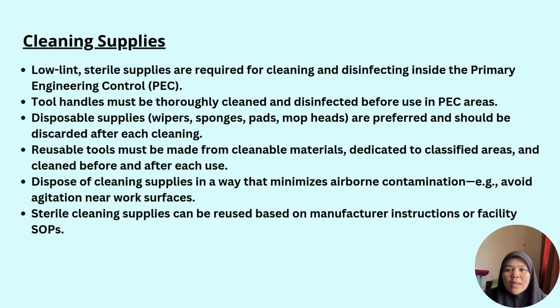Cleaning supplies used in the prefilled syringes production area must meet strict standards to preserve sterility integrity. All materials must be low-lint and sterile, especially when used inside the primary engineering control, PEC. Tool handles require disinfection before PEC use, and disposable items like wipes and mop heads are preferred to minimize cross-contamination, being discarded after each use. When reusable tools are employed, they must be made of cleanable, dedicated material and disinfected both before and after each use. Disposal methods should prevent the spread of contaminants into the air. No shaking or agitating near sterile zones. Lastly, sterile supplies may be reused only if guided by SOP or manufacturer instructions, ensuring safety and regulatory compliance.